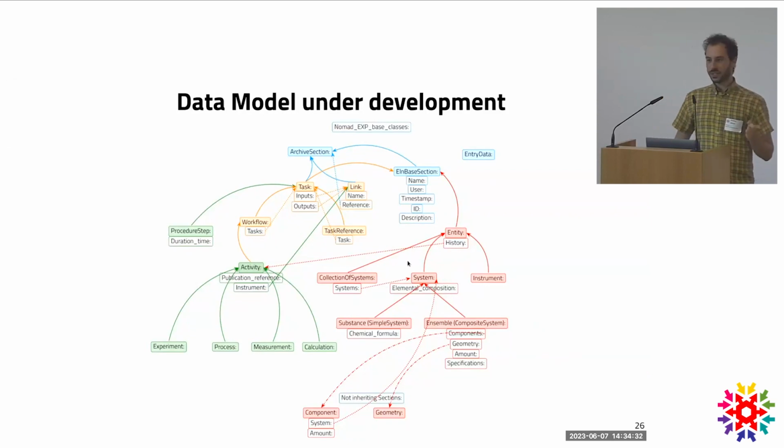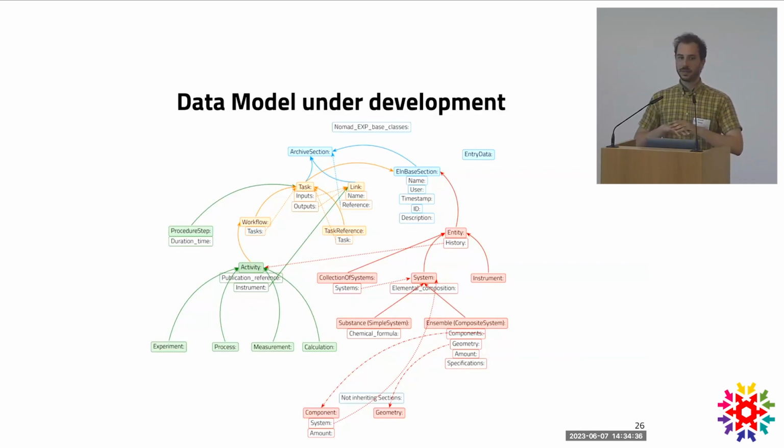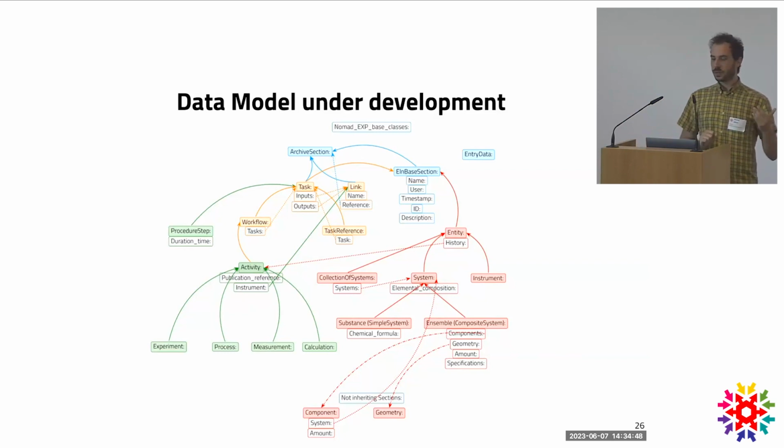This complex structure is meant to describe the workflow in our lab, including all the parts of the research activity that we do, from the description of the materials that we have in our bottles, on our shelf, to the workflow composed of actions that we perform and that we can somehow standardize. This is our main goal: to catch the full workflow of the research activities.